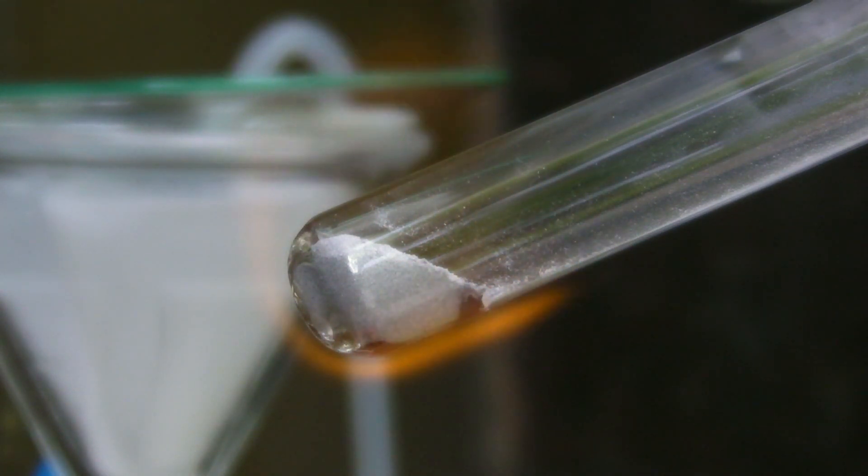After a short while the test tube turns black, because the glass is reduced to silicon by the magnesium.